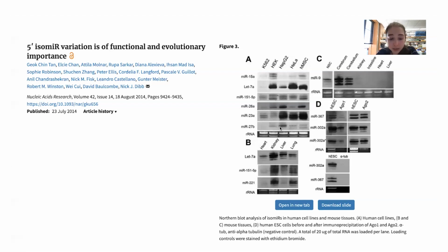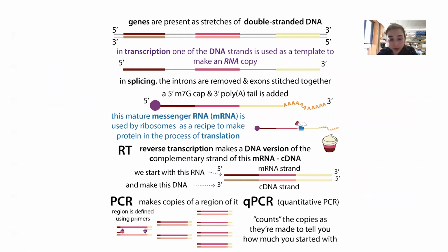Another reason why you might want to use northern blot, in addition to small RNAs being hard, is that depending on what type of primers you're using for the reverse transcription step, they can have bias as to what gets copied. So you could have sequences that are present but that are getting missed with the method.